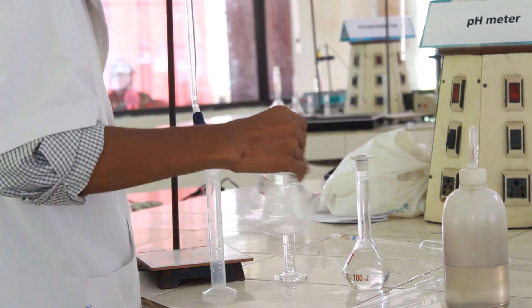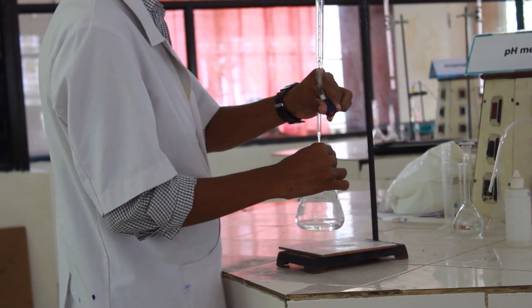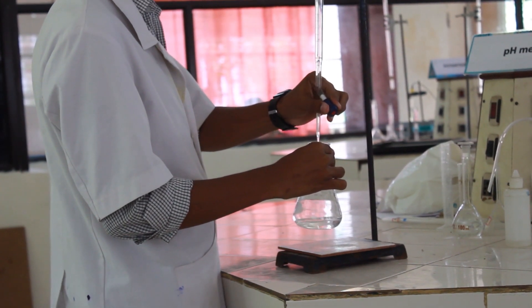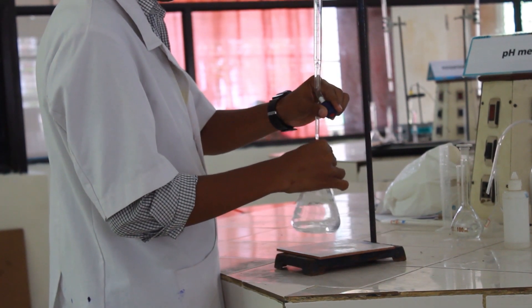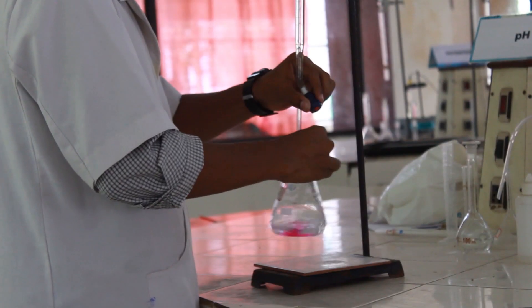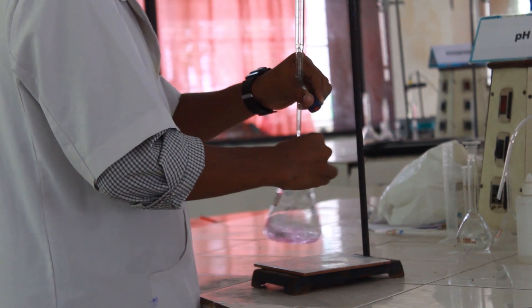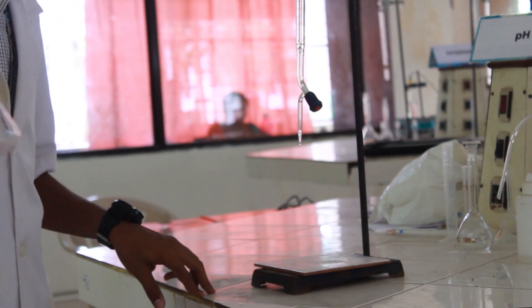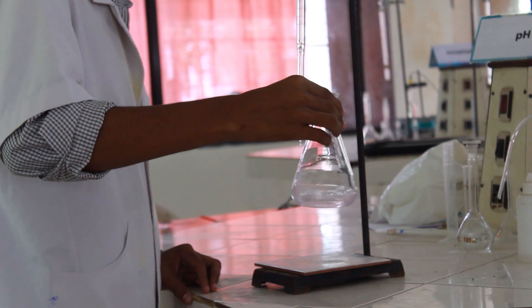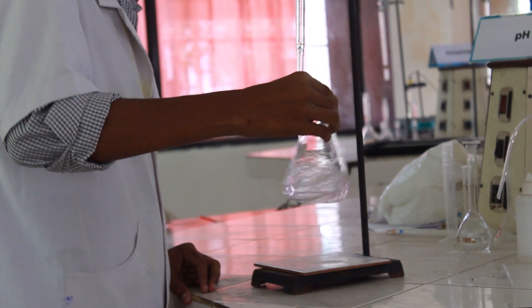Titrate this mixture using sodium hydroxide solution already taken into the burette. Add drop by drop the sodium hydroxide solution from the burette into the conical flask. Continuous swirling always gives homogeneous reaction mixing, so do not stop the mixing at any point.